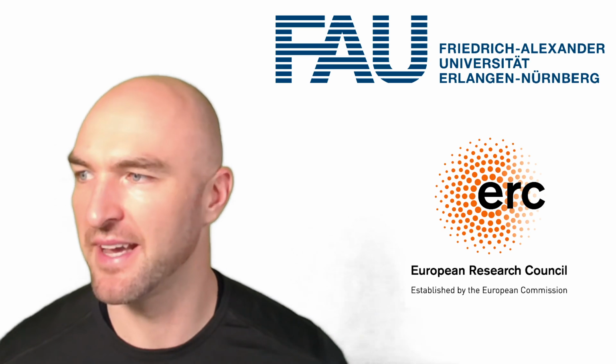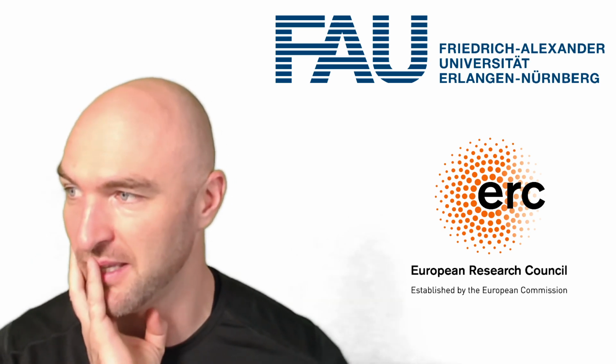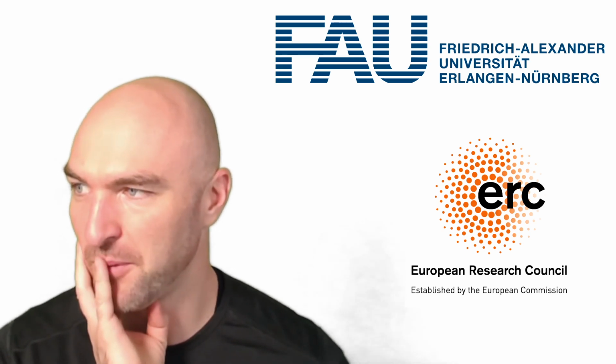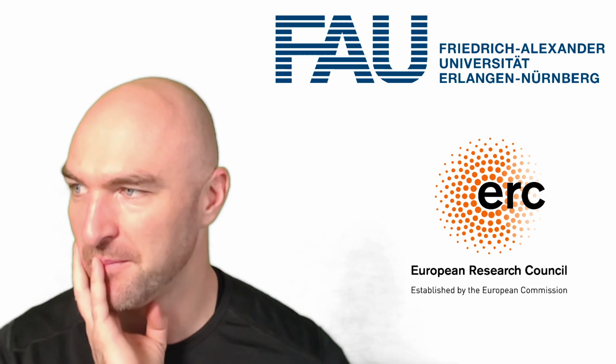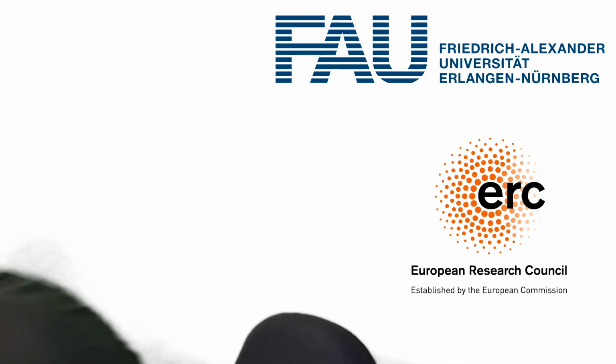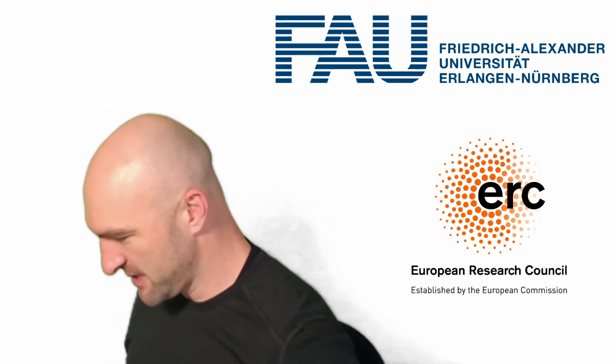Oh, bloody hell! Sorry, I totally forgot to take the pound sign out of the post to table function again. Really, my bad. I will push that straight away because that's like a 50-second fix.